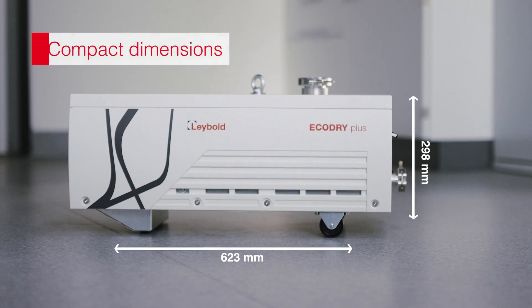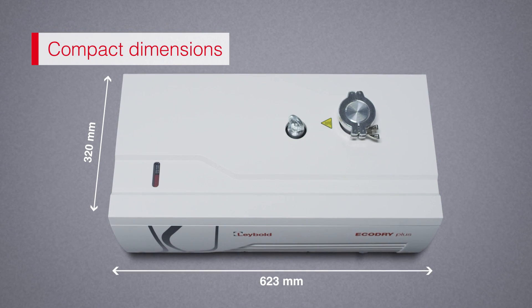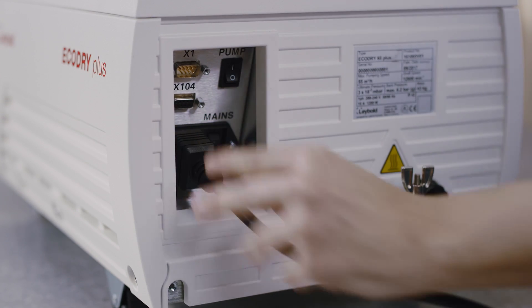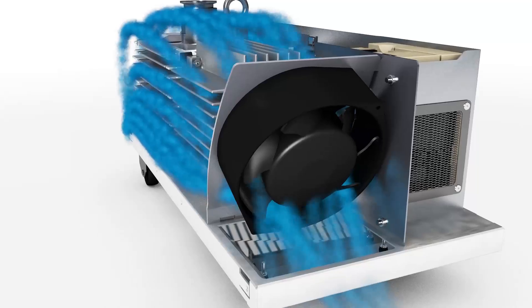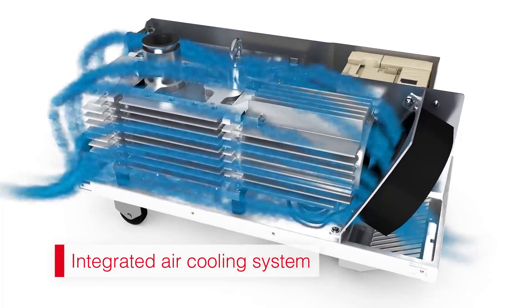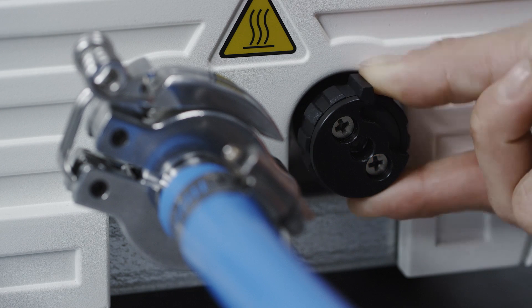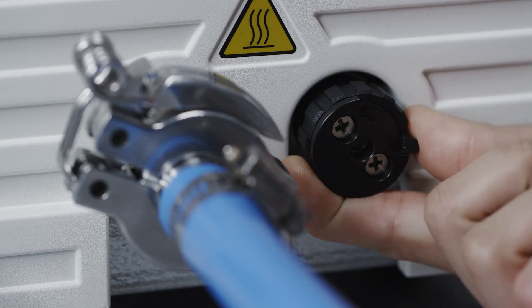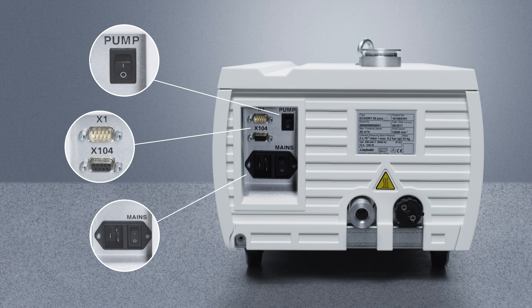Thanks to its compact dimensions, installation is just as easy. The eco dry plus can be plugged into a regular wall socket. Thanks to the integrated air cooling, no coolant circuit is required. All operating elements are conveniently located on one side of the pump: a gas ballast switch for pumping condensing vapors, the power socket, the start-stop switch, as well as interfaces for remote operation via a control system or computer.